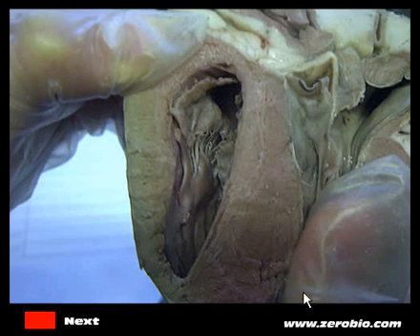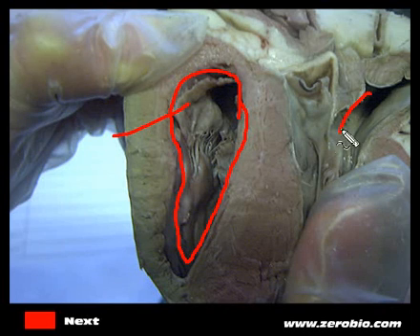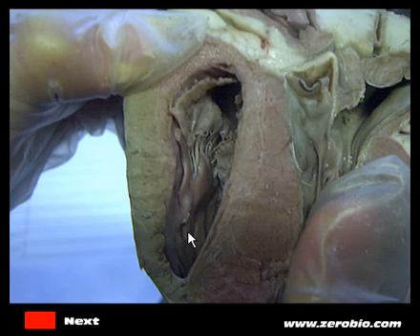Now we're zoomed in. Notice how thin this side of the wall is, and there's the septum — so which chamber is this? You can see a valve there. This is the right ventricle right through here. Tracing it out, we can see an AV valve in there and the left atrium over on this side as well. Hope that helped — we'll see you again soon.